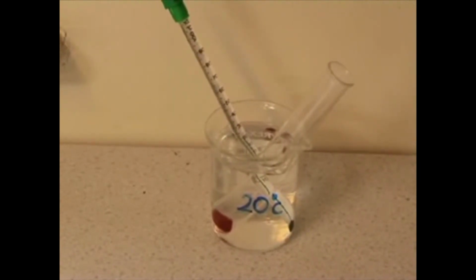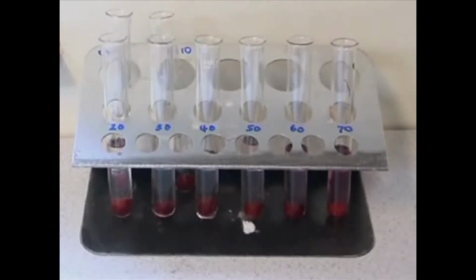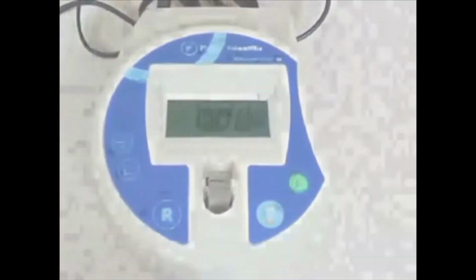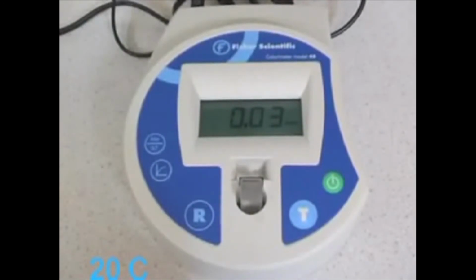Here's the test tube in a beaker of water at 20 centigrade. Others were in water baths and in beakers with ice. Once the test tubes have been in the water at different temperatures for a fixed amount of time in each case, the subsequent water is poured into a cuvette and then its absorbance read on a colorimeter.